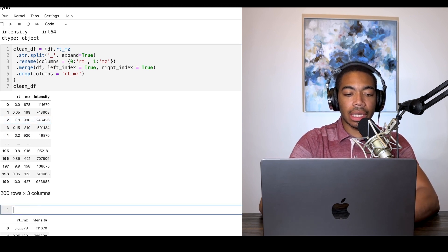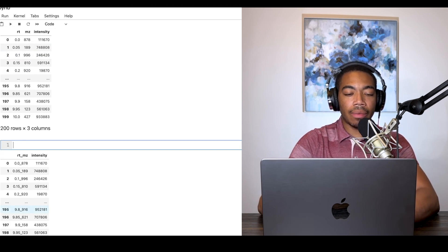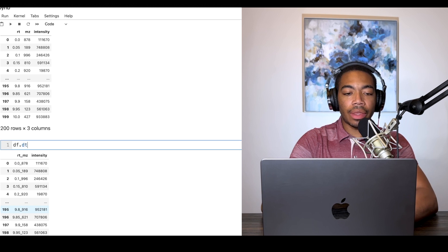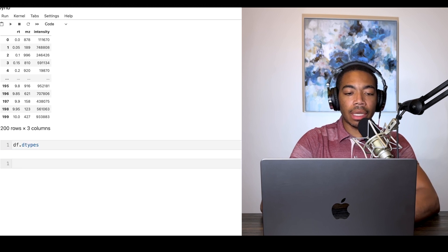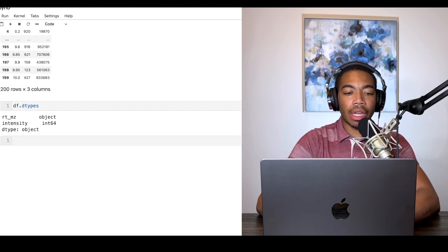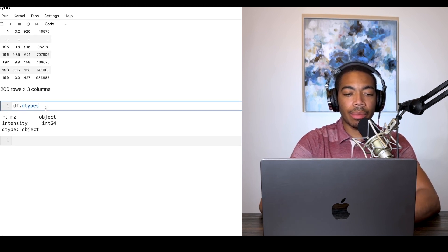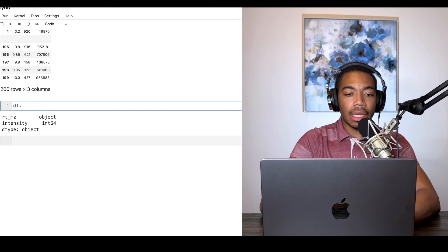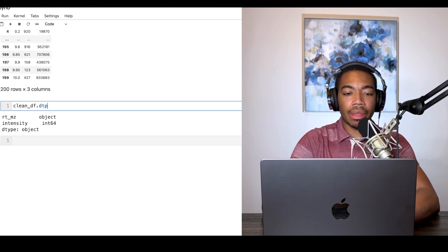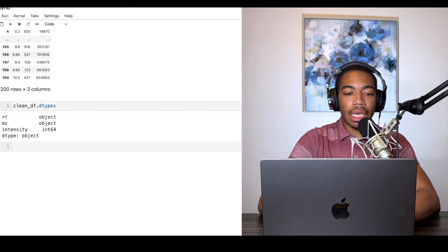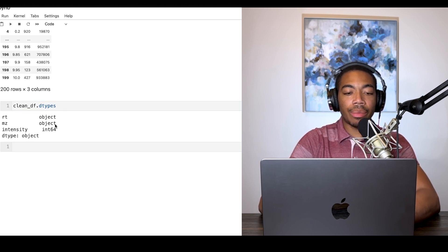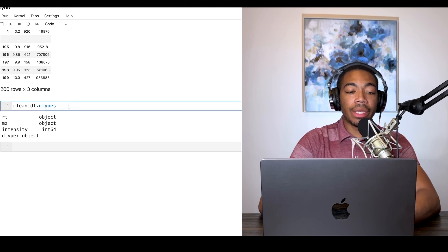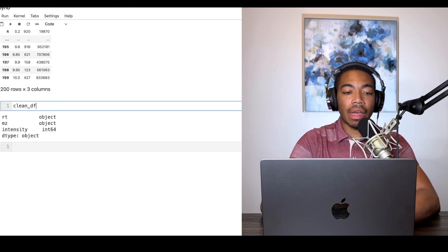Let's take one more look at it. I showed you earlier that the dtypes of the original dataframe, the rt_mz column, was an object data type. Let's look at clean_df and look at the same method. You see that our rt_mz column remains as the object data type, so these are still considered string values even though they look numeric.